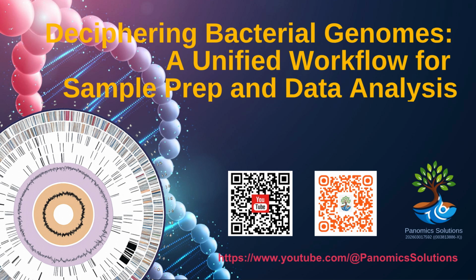In today's brief lecture, we will explore how to decipher bacterial genomes through a unified workflow for sample preparation and data analysis. Throughout this session, I will guide you through the complete bacterial genome sequencing pipeline, from sample preparation and DNA quality assessment to sequencing strategies, genome assembly, genome annotation, and some basic downstream bioinformatics analysis.